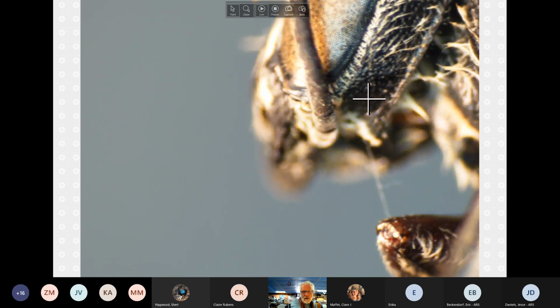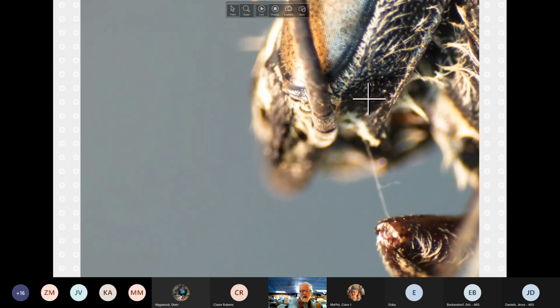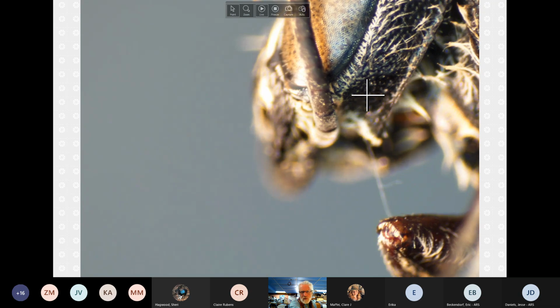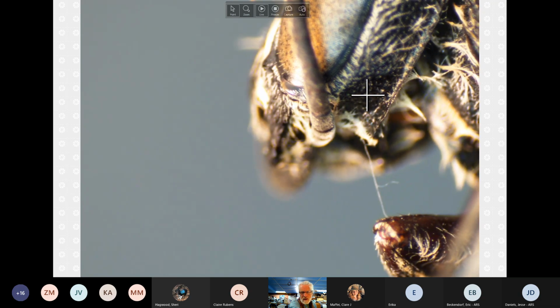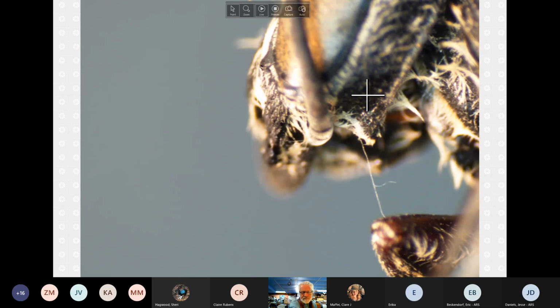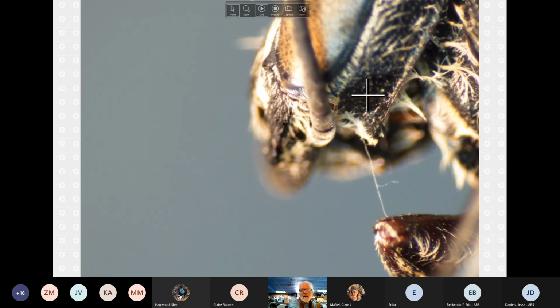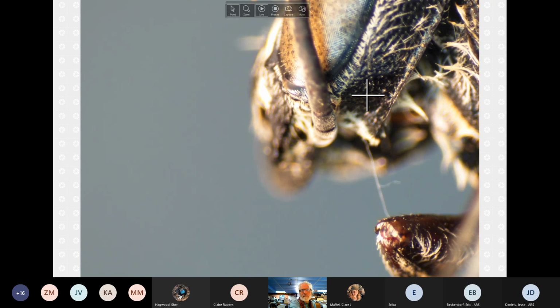So it's scored for having none or lined with hairs, and without the upper line or strip of hairs up there. So you can see there's a few hairs in there. And that's probably why it's scored for both, because it could be interpreted either way. But it's certainly not like the fovea on an andrina, which is covered in those kinds of hairs.